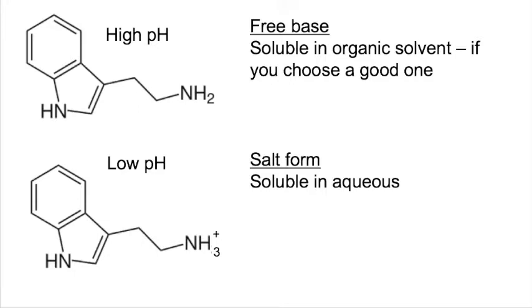Okay, so I put this at the end, but this is a really important part of these extractions. If you're dealing with compounds that have what we call ionizable groups, if they have acidic or basic properties, then you have to control the pH if you are dealing with water, if you're dealing with an aqueous layer. So really, never use water alone when it comes to drugs, because pretty much all drugs are going to be acids or bases. There's a few neutrals. Most drugs are bases, and both tryptamine and methapyrilene are bases.